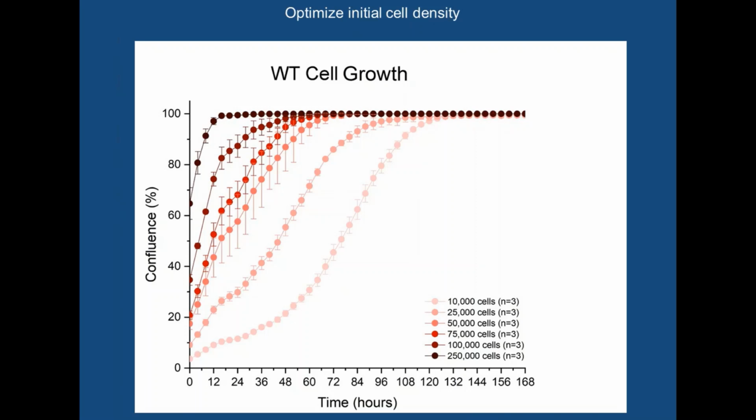So in the last few slides, I'd like to take you through just a sense of how we have done our experimental design, from really having never used the instrument all the way to being able to take very meaningful data. And I'm going to show you growth curves rather than showing you the cells, because in the interest of time, I think it will really help you get a sense of how we've done this.